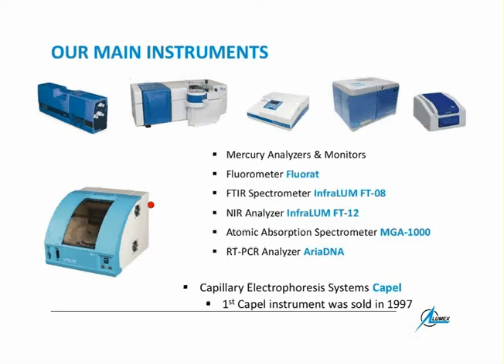Let me now come closer to the discussion. I know that many people ask the most important question: what is the reproducibility of migration times in capillary electrophoresis? Because CE is a separation technique.